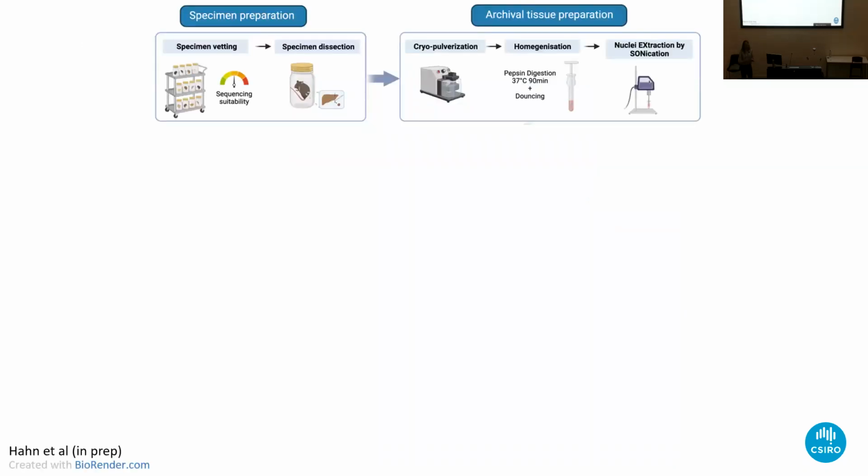The archival assays took a bit of work to optimize for vertebrate tissues. This component of the assay, where we go from the tissue itself to isolating nuclei, took about 5 years of work. It's like chiseling a very fine strand of hair out of cement. You want to use both a jackhammer and a very fine brush to get at it. So it's a combination of different methods, intermittently going hard and then very carefully teasing the chromatin out of the heavily fixed tissue.